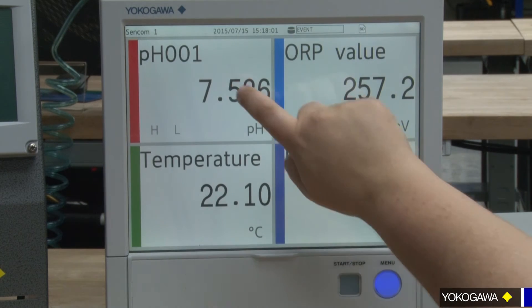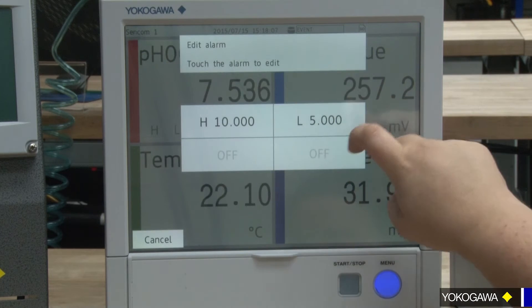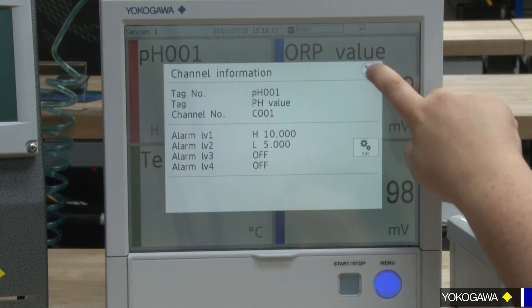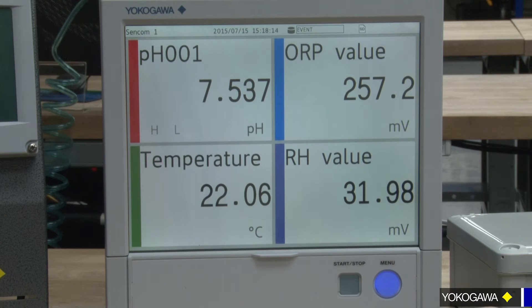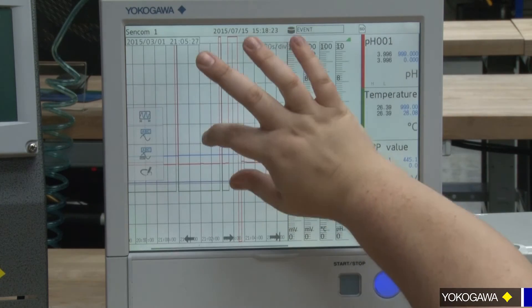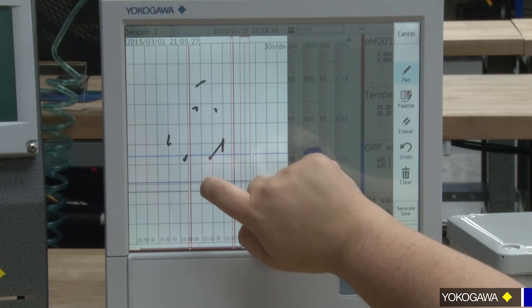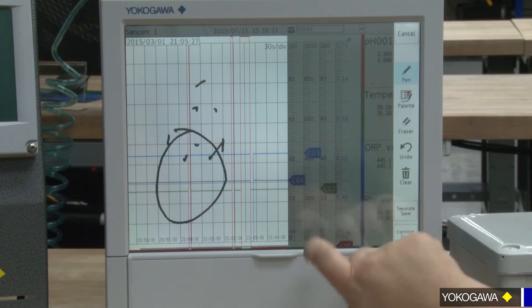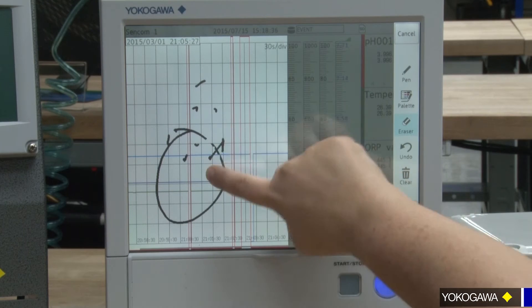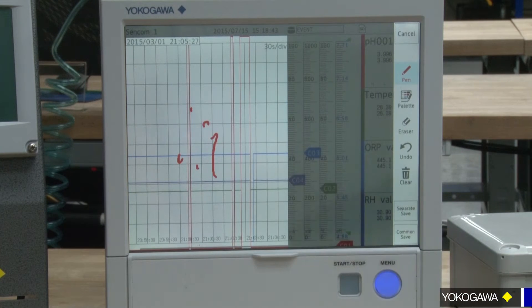You can set high and low alarms for whatever you want. You can easily edit it, turn it on, turn it off, and when you get an alarm, it'll give you an arrow code flashing on the display — very user friendly. Your trend graphs — this is something that traditional analyzers don't have the capability of. You can zoom in, you can zoom out, you can write on there, you can circle something. You have different capabilities — you can erase what you wrote or clear it all. You can do different color writings if something needs to stand out. This is something traditional trend graphs and analyzers don't already have.